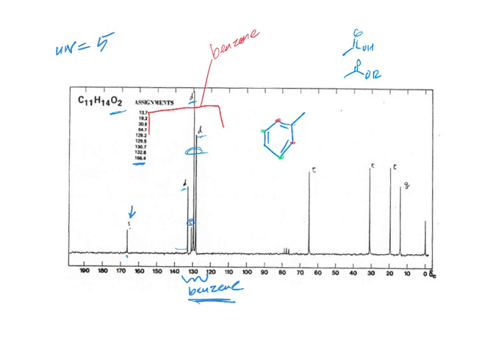So these 2 carbons would be the same, and these 2 would be the same, and those would be the 2 big peaks. And then this one in yellow would probably be the smaller one. Even though we can't integrate the peaks, I think we could say that if we have 3 peaks for protonated carbons, they're all doublets, all protonated, then their T1s are probably relatively similar and they relax, so we're getting kind of a 2-to-1 ratio. So which one is the red one? Which one is the green one? I don't think at this point we can really say. Those are pretty close together. Maybe as we put the rest of the structure together, we'll try to say which one would be more or less upfield.